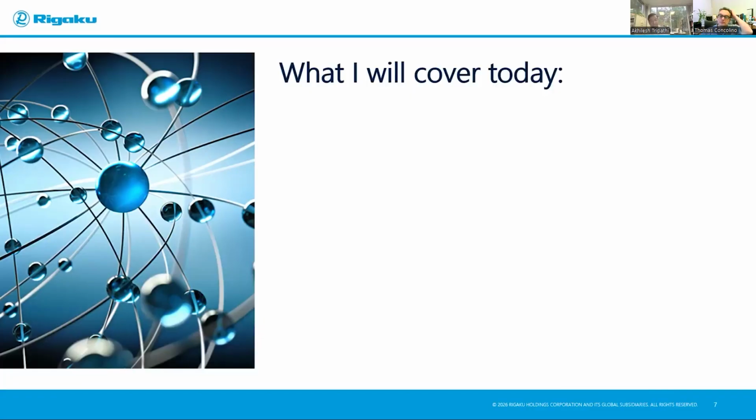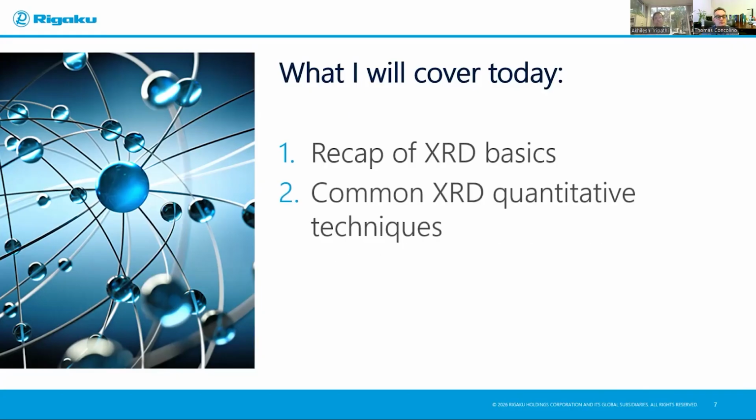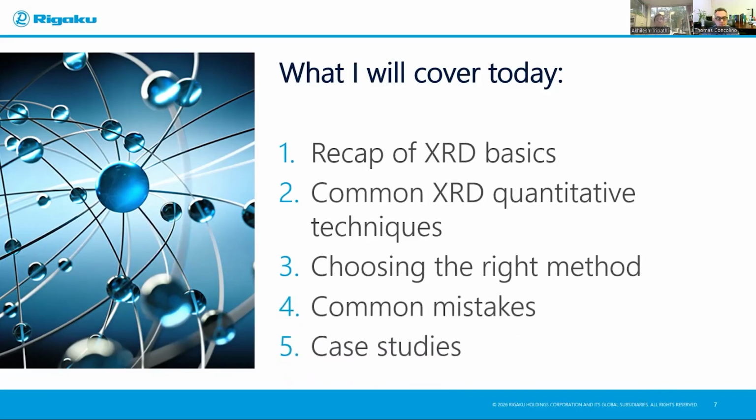So, in the past webinar series, we have covered the basics of XRD. So what I have planned today is I'll cover the recap of XRD basics. I'll talk about common XRD quantitative techniques, choosing the right method, what suits you, common mistakes, and some case study. So let's begin with XRD basics. So recap of XRD basics.